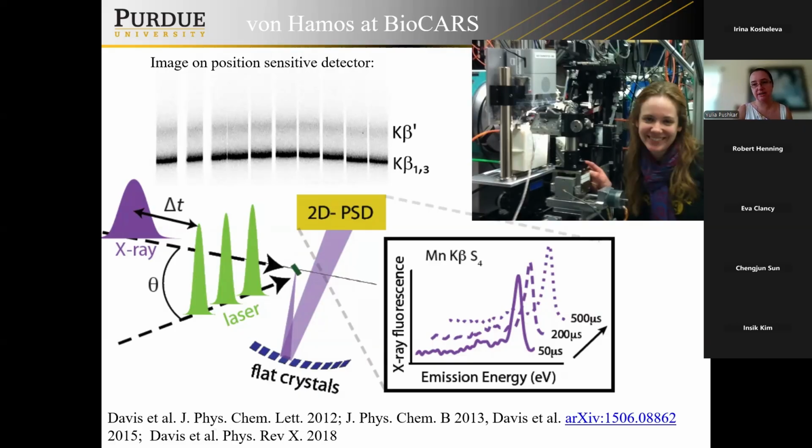And we started collecting time-resolved data. And here you see that the system had a 3D-printed frame, and the 3D-printed frame contained simple flat crystals, but it was printed with a certain geometry so that they have a dispersive direction here.